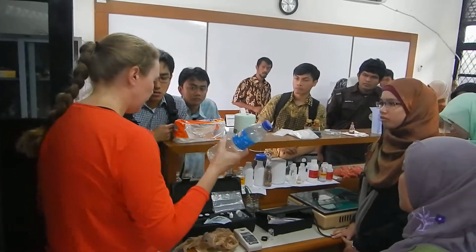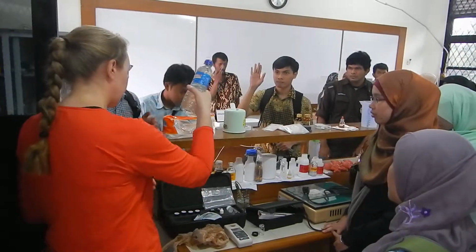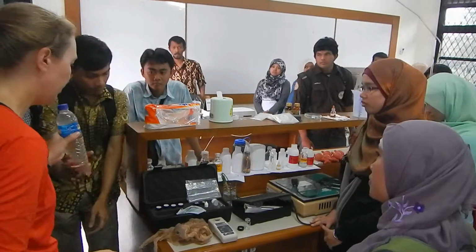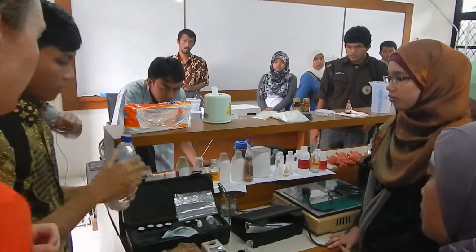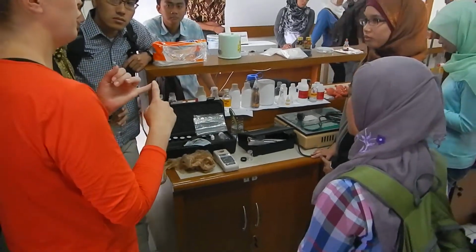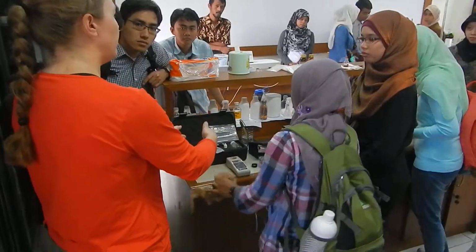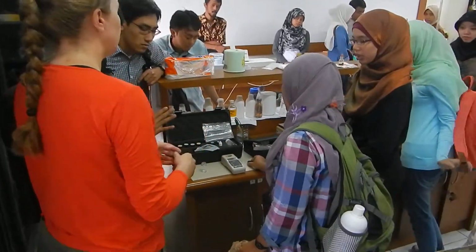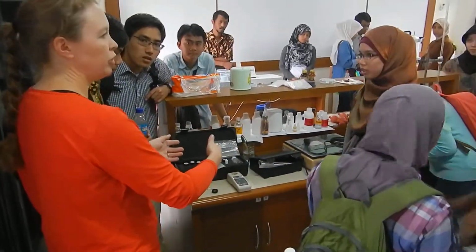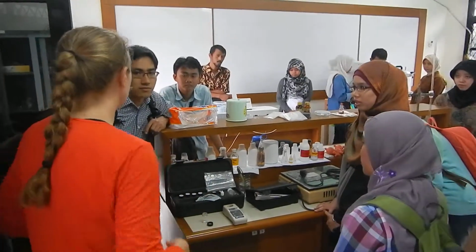All right, so I'll let somebody do this. Anybody? Takers? Come take. All right. So basically, you're going to fill this one vial up, and we can do a few of them this way if you want. The other very important thing is all turbidity meters are a little bit different. So if you start a research project with a certain type of turbidity meter, stay with it throughout the entire project. And when you write your results up, it's very important that you tell them what kind of meter you use. Because I can use this meter and another one may give me slightly different results, okay?